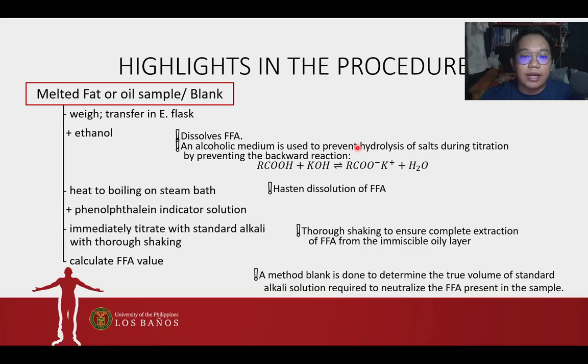So again, ito ay weighing by difference. So yung sa video natin, wag nyong gagayahin yon. Yung sample natin, for example, e-flask nakalagay na sa pan, sa balance. Then tsaka tayo maglalagay ng sample dun sa loob ng balance. So medyo hindi ganun yung tamang practice.